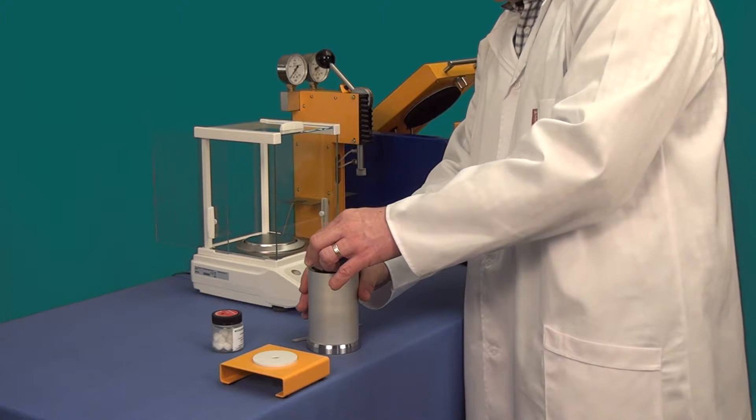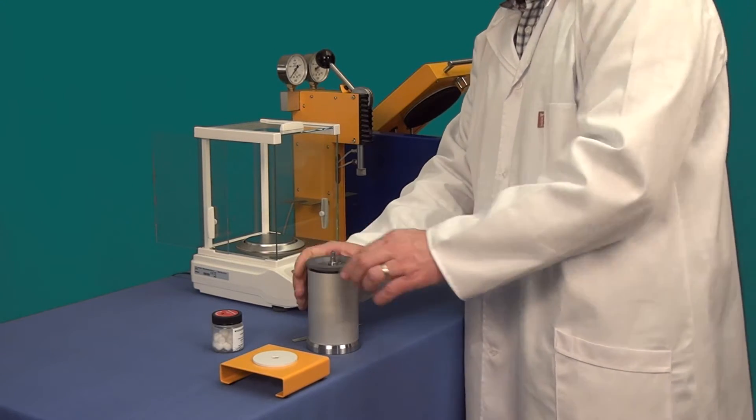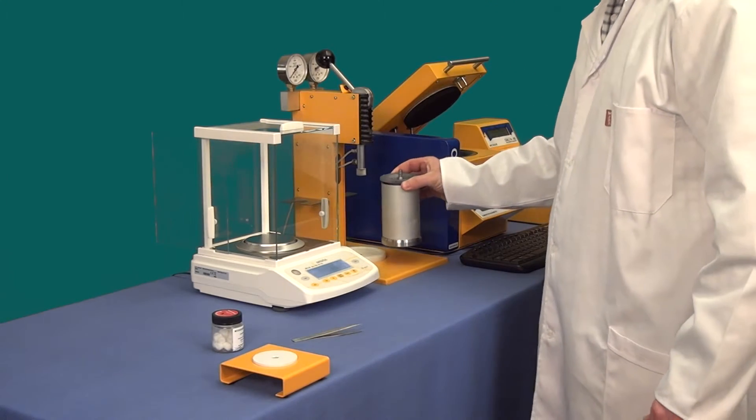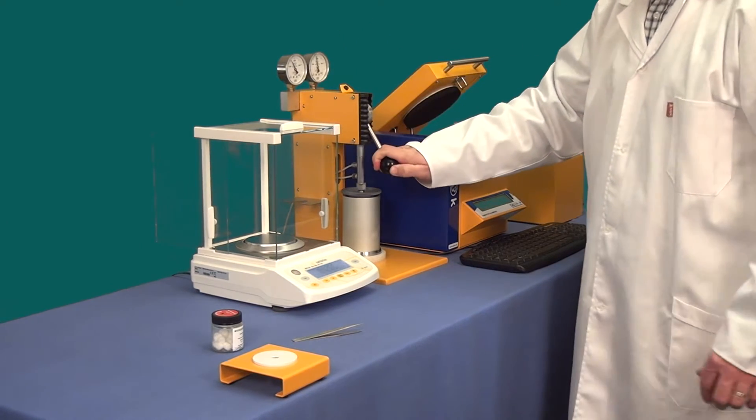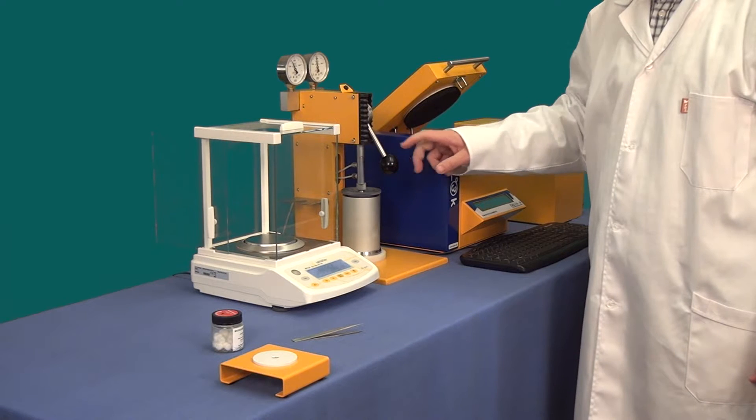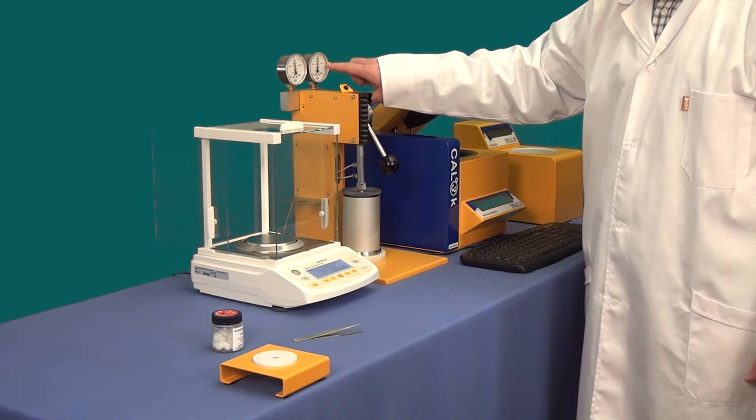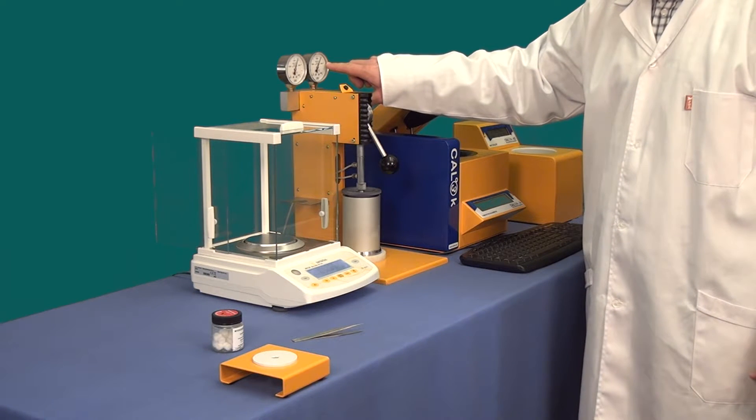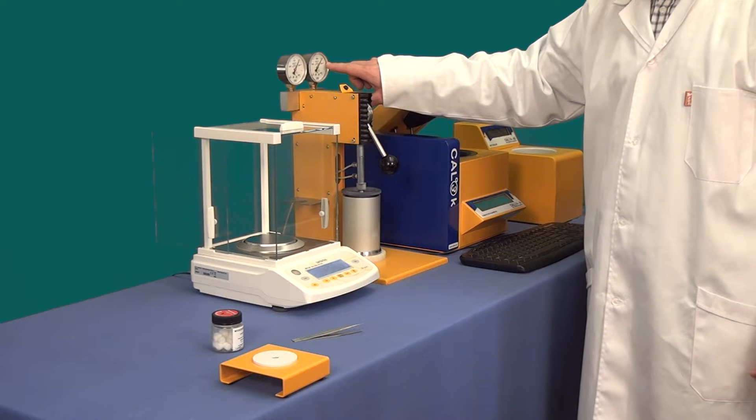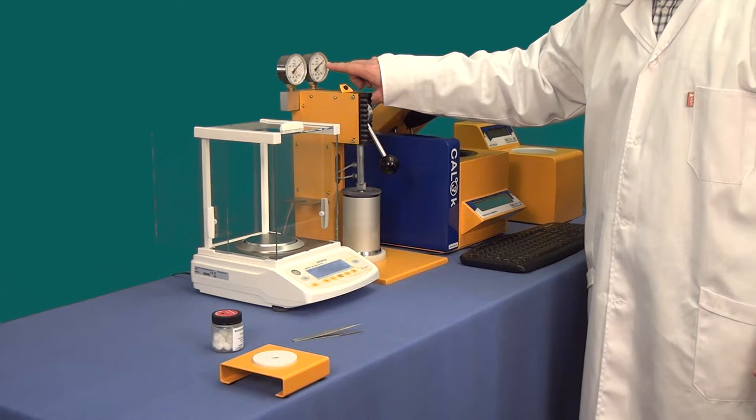Place the lid assembly nice and easily into the bomb vessel and close the lid firmly. Place the bomb vessel into the filling station and fill the vessel with oxygen. It will take approximately 15 to 20 seconds for the bomb to fill with oxygen. The target is 3000 kPa as indicated.